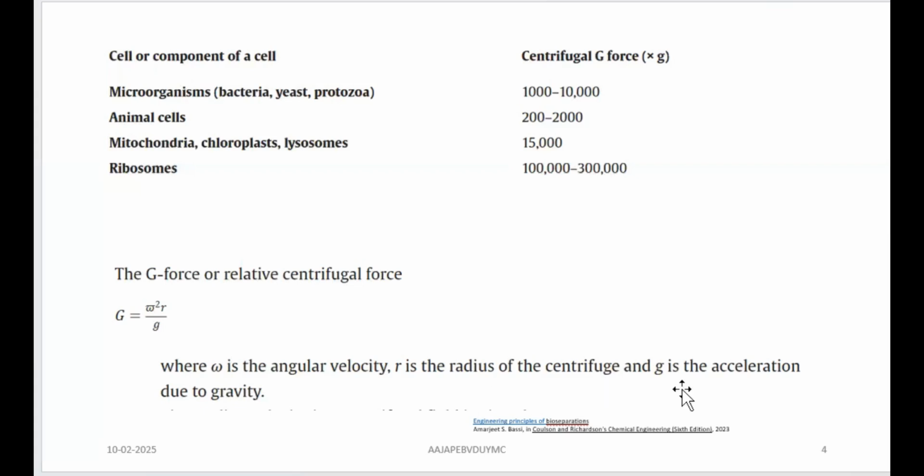Can you just imagine the instrument that you are using in the laboratory? You have the rotors. In the rotors you have the sockets to keep the tubes, and the rotors either have small size tubes, or they can hold big size tubes, but the tube gets aligned at a particular angle with reference to the central shaft.